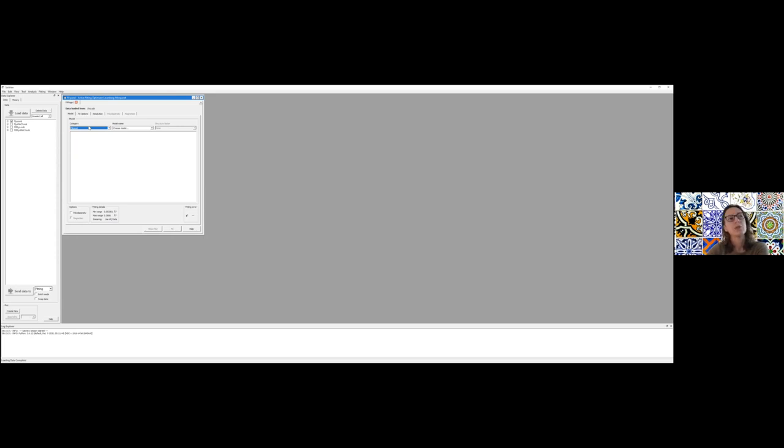And then if you need a more specific model, or if you want to do your own, there are also options to introduce your own model. And it's not too difficult. And again, if you don't know how to do this, just give us a shout because the developers are very responsive and they can help you do that. And at least once a year, we have a hackathon where we try to help people do some modeling.